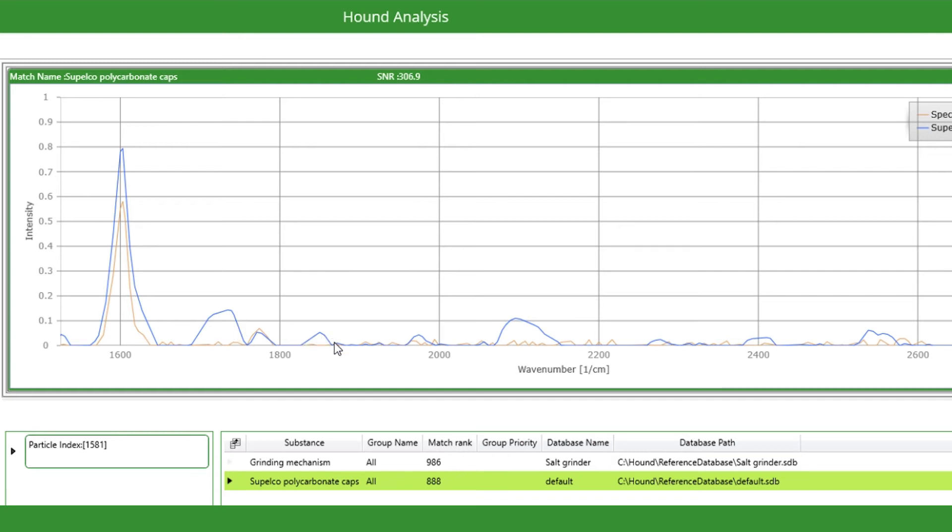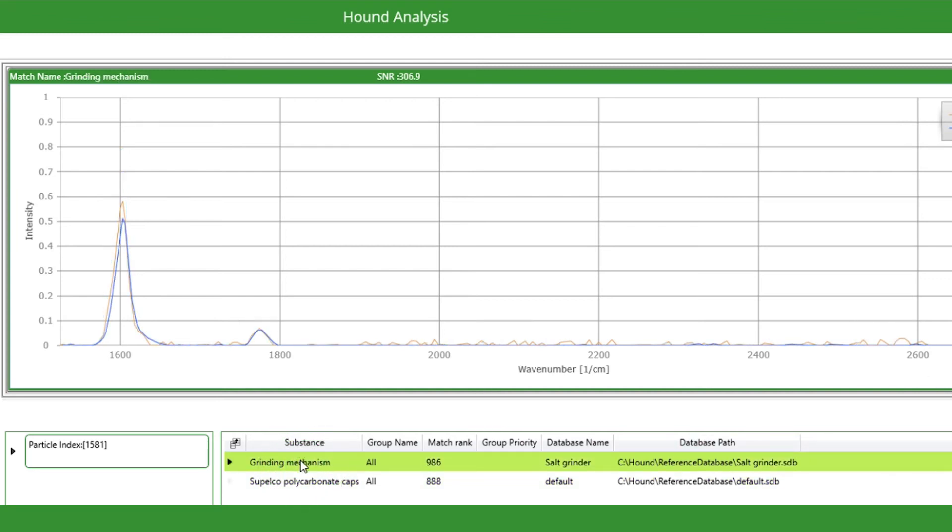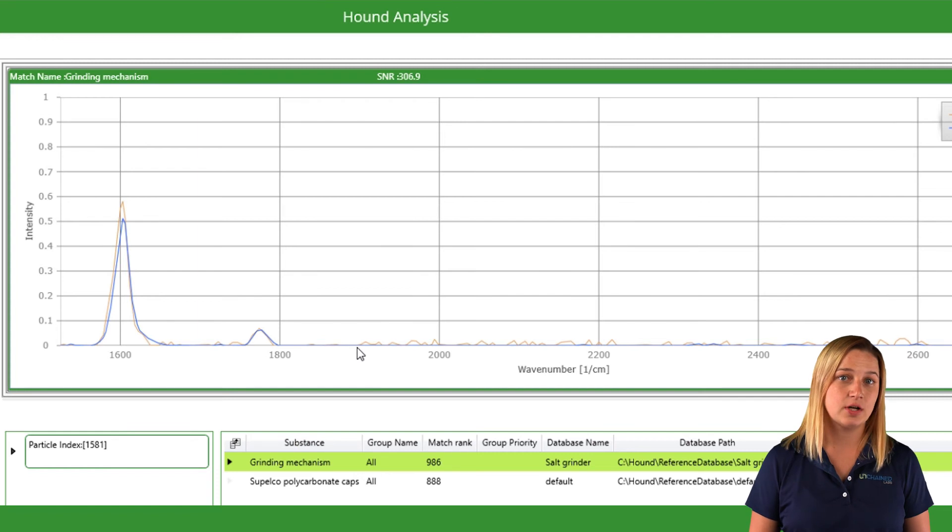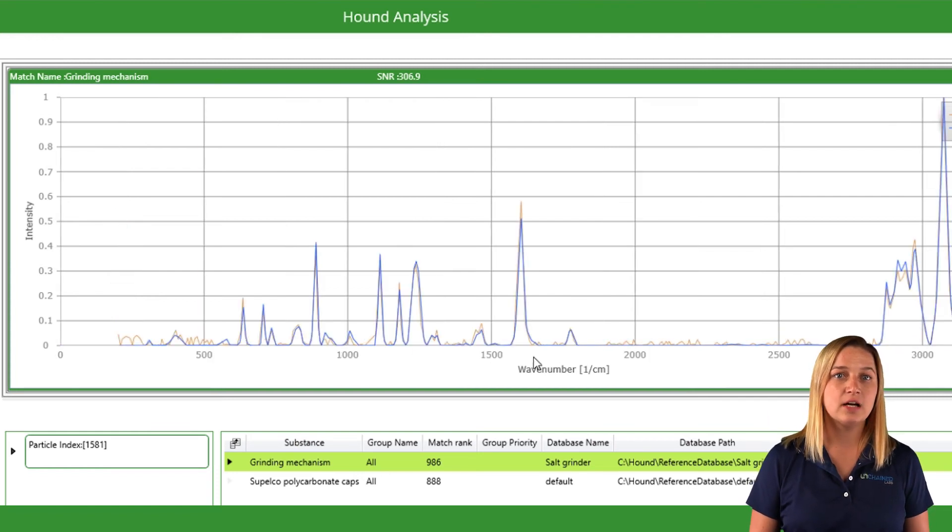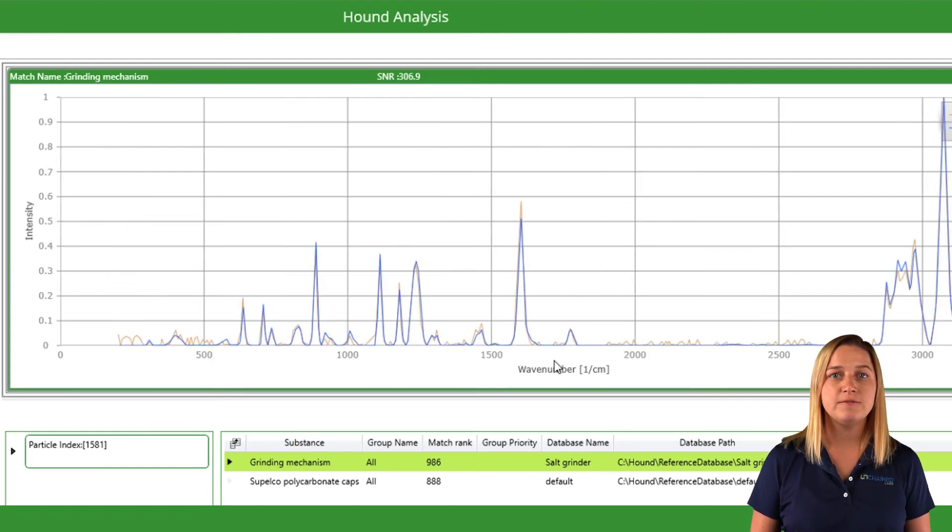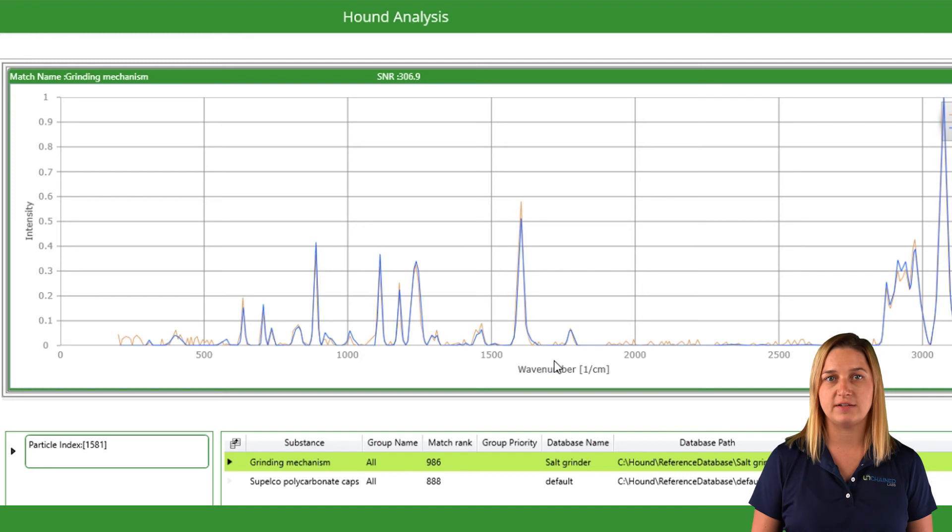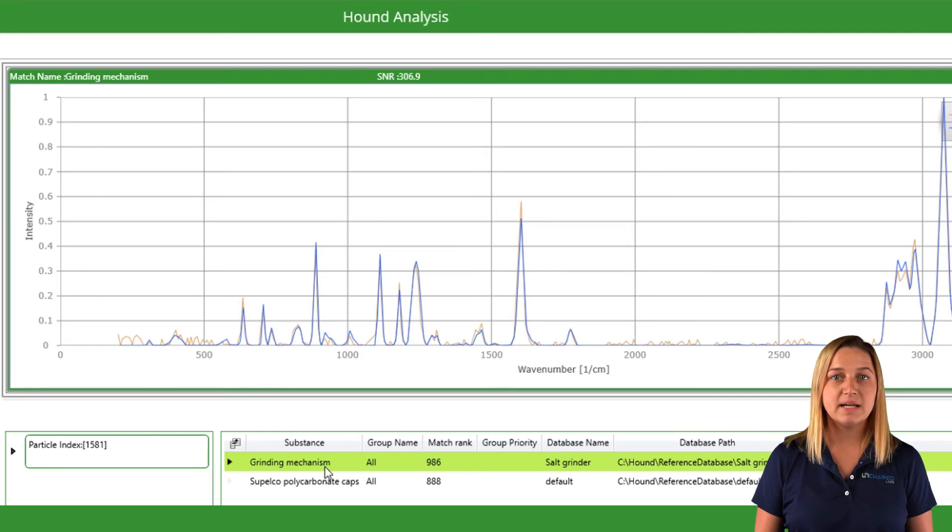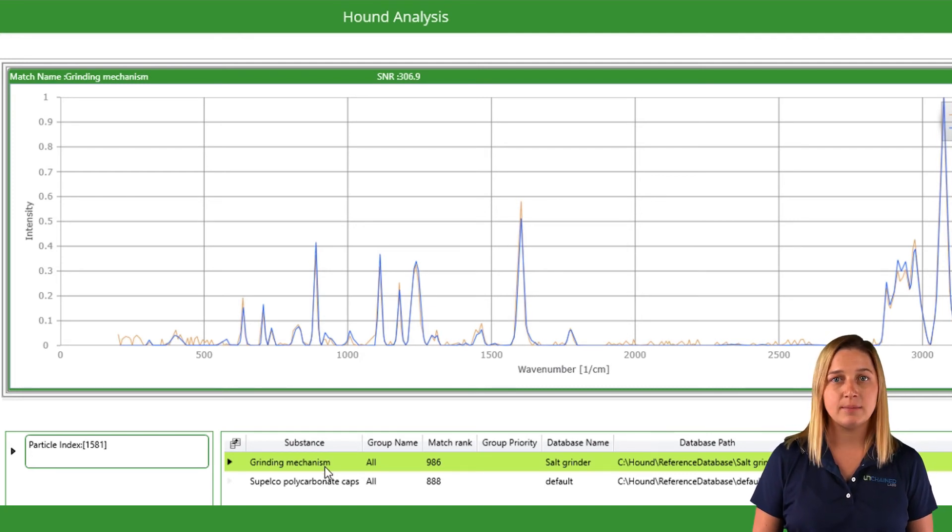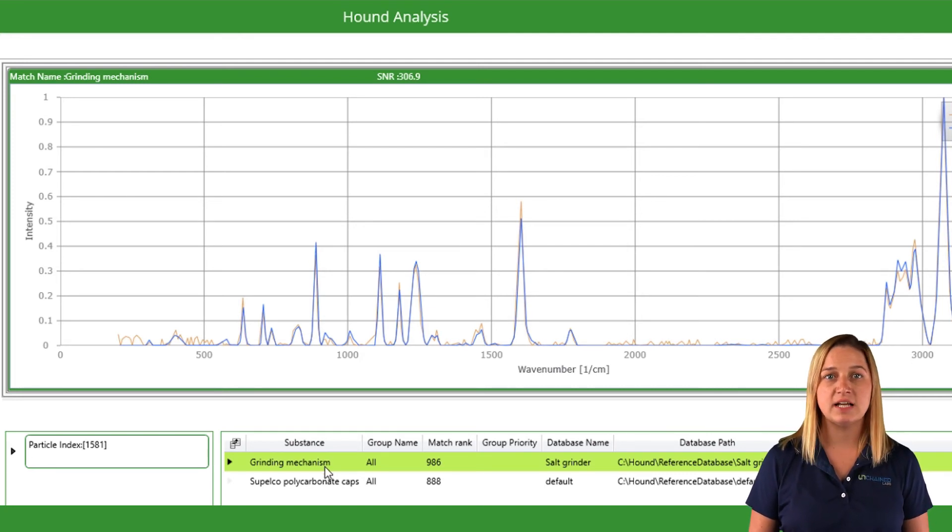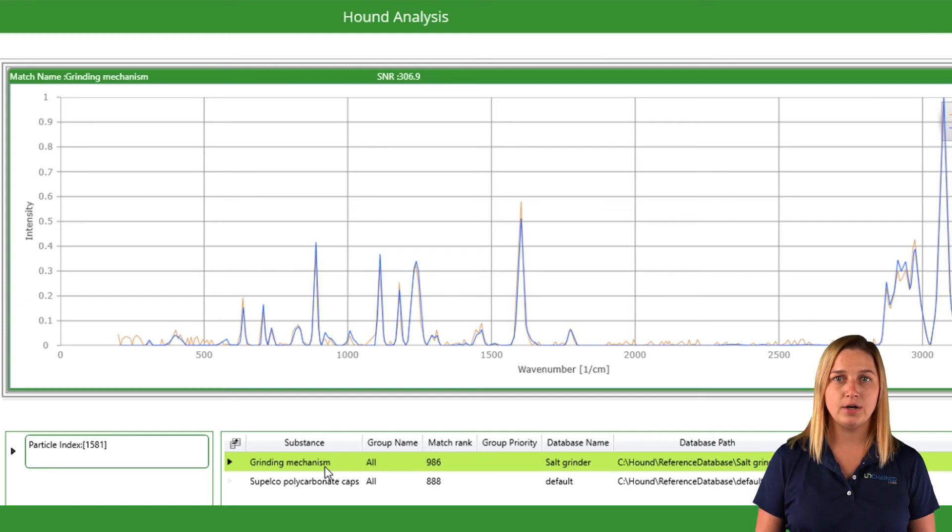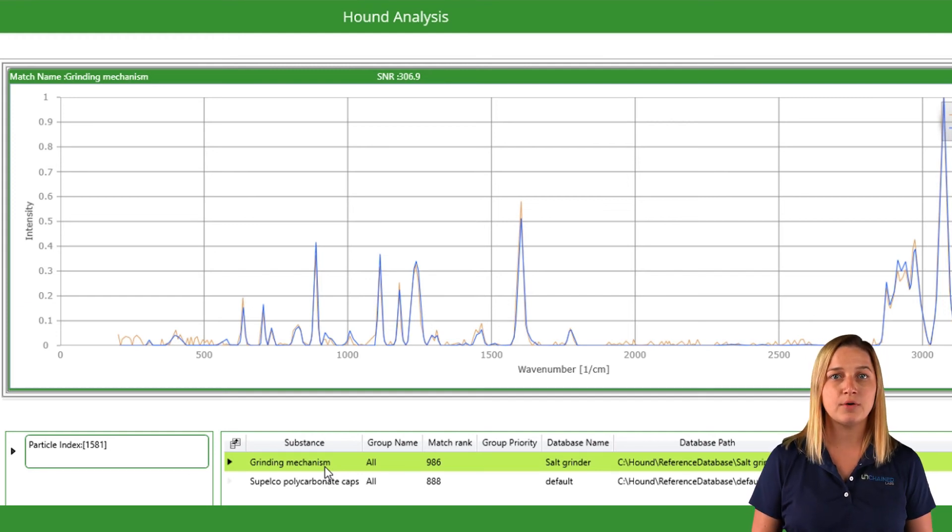Compare the same spectrum with the grinder and you see a closer match, suggesting fewer physical differences. Basically, what we're seeing here is that about half a percent of the particles coming out of the salt grinder are polycarbonate from the grinder itself.